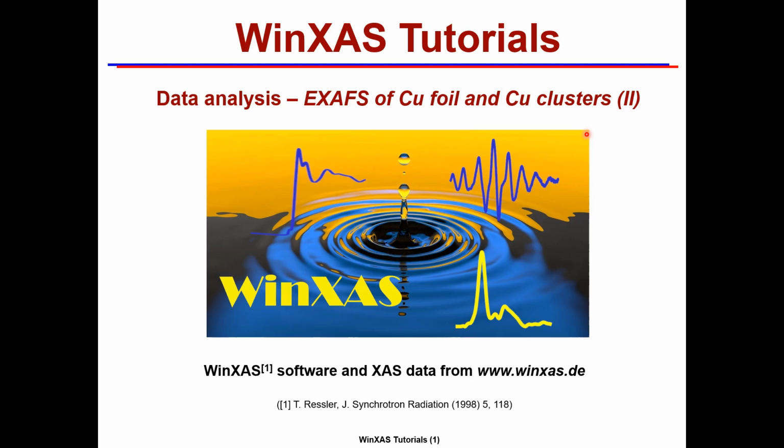This is somewhat of a follow-up to the previous tutorials about using experimental and theoretical phases and amplitudes for EXAFS refinement. As always, the WinXAS software and the XAS data I will be using in the hands-on session can be obtained from the WinXAS website.